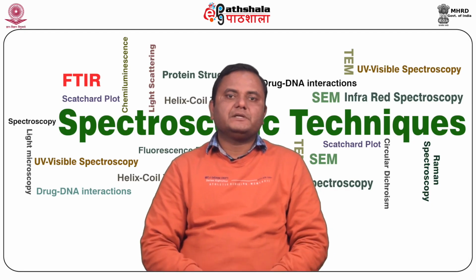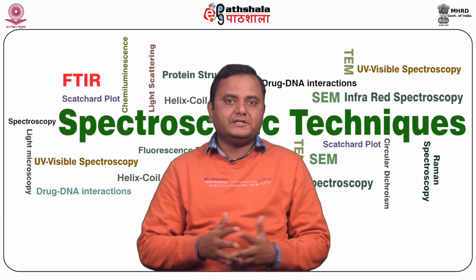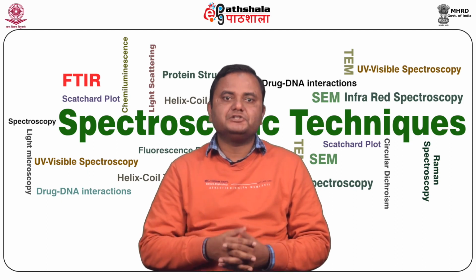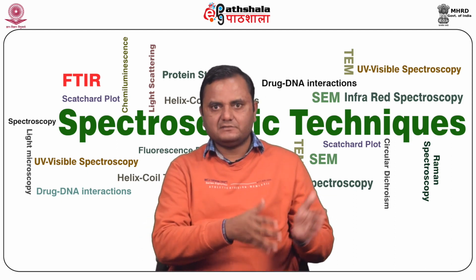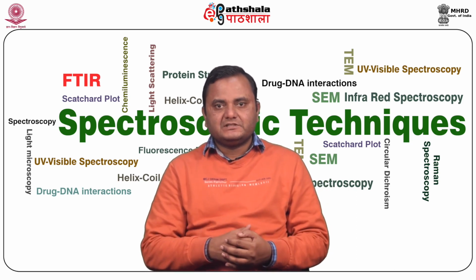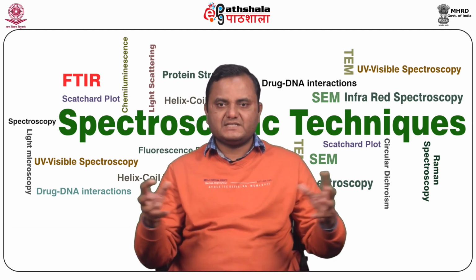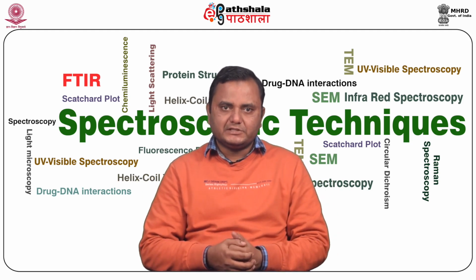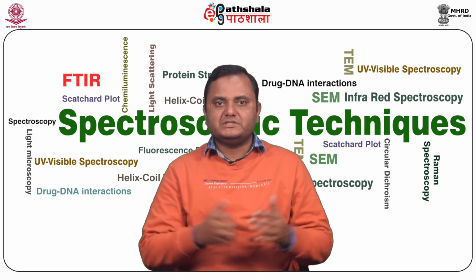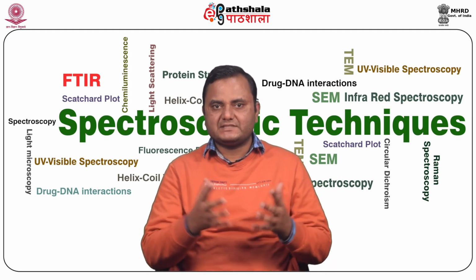Now we discuss the application of fluorescence for proteins. It is used for the analytical detection of the presence of protein, and to monitor changes in quantum yield as an indication of a changing environment such as binding, unfolding, etc. FRET is used for calculating the distance of fluorescent groups from each other if they are placed at a distance in the range of 1 to 10 nanometer. And change in fluorescence polarization is used to determine the shape and size of the molecule based on the tumbling dependence on shape and size.